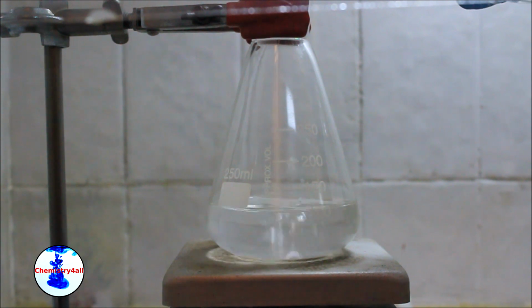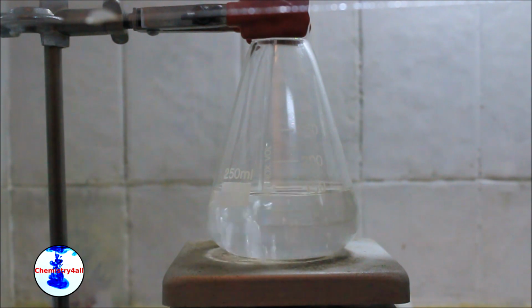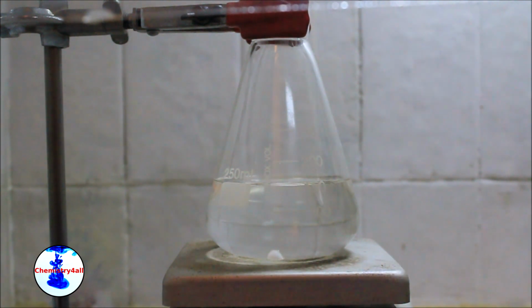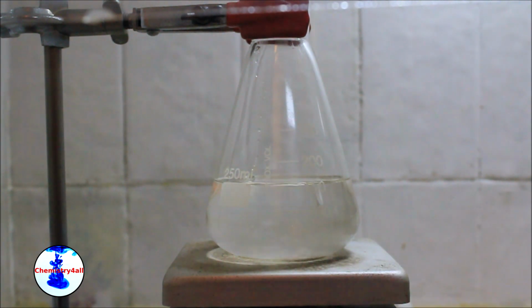Then, the glacial acetic acid can be slowly added to the reaction mixture under constant stirring. And finally, the sulfuric acid is added dropwise to the reaction mixture. The solution can be then homogenized for a while.